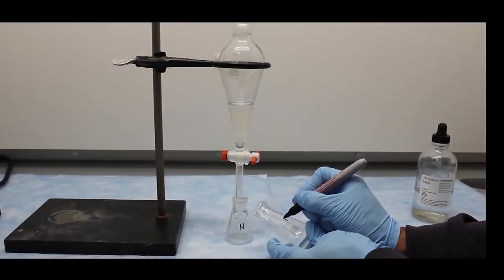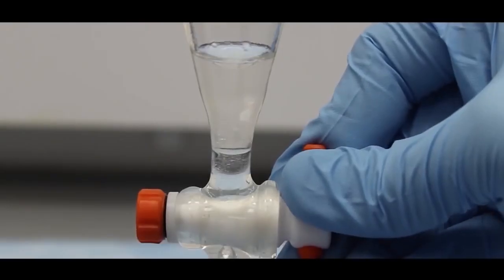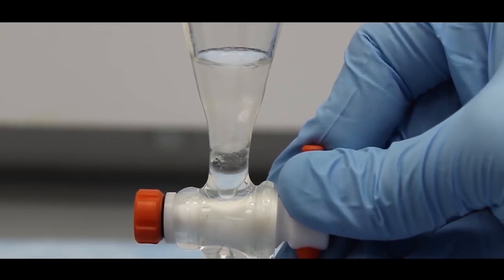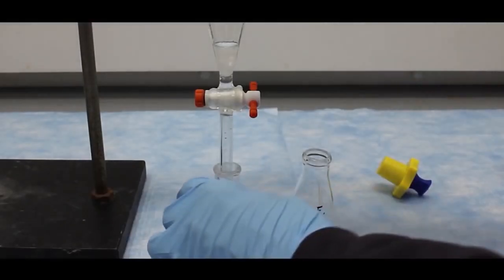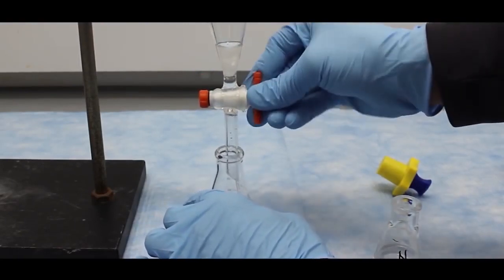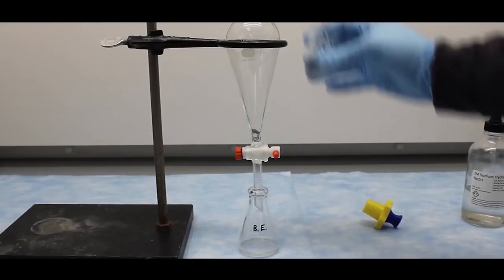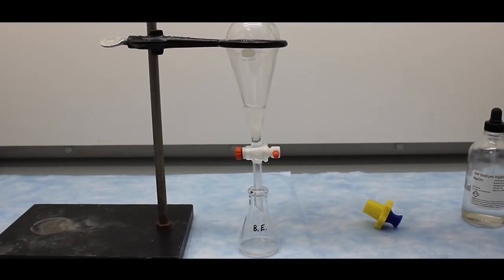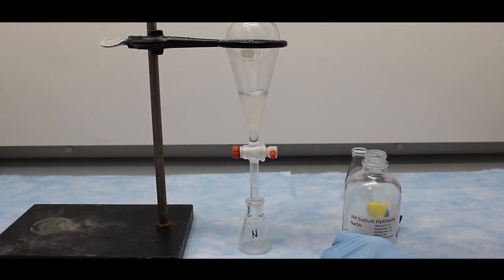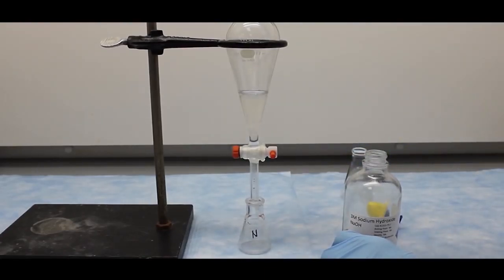I will label a new flask BE for the base extracted aqueous layer. First though, I will drain off the bottom neutral DCM layer. And then collect the base extracted aqueous layer. I will close the sep funnel and pour back in the neutral DCM layer. Then extract it one more time with approximately 5 milliliters of the 3 molar sodium hydroxide solution.